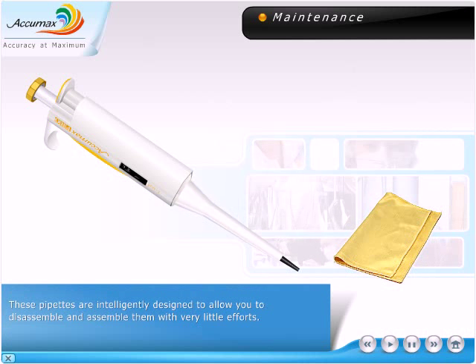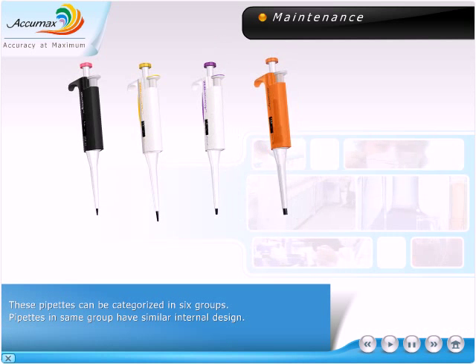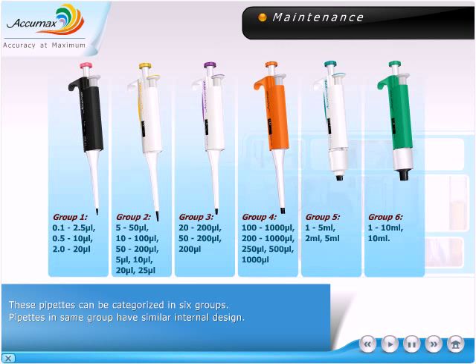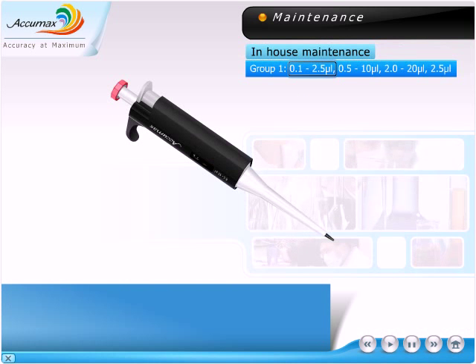These pipettes are intelligently designed to allow you to disassemble and assemble them with very little effort. These pipettes can be categorized in six groups. Pipettes in the same group have similar internal design. Group 1: 0.1 to 2.5 microliter, 0.5 to 10 microliter, 2.0 to 20 microliter, and 2.5 microliter.